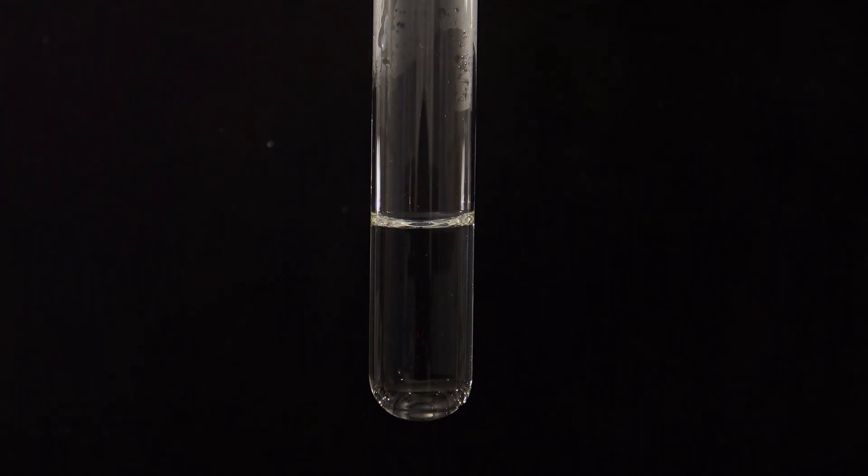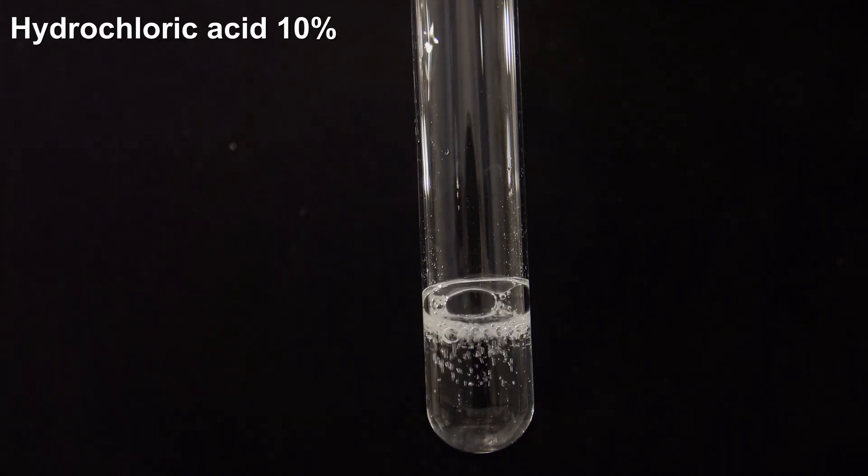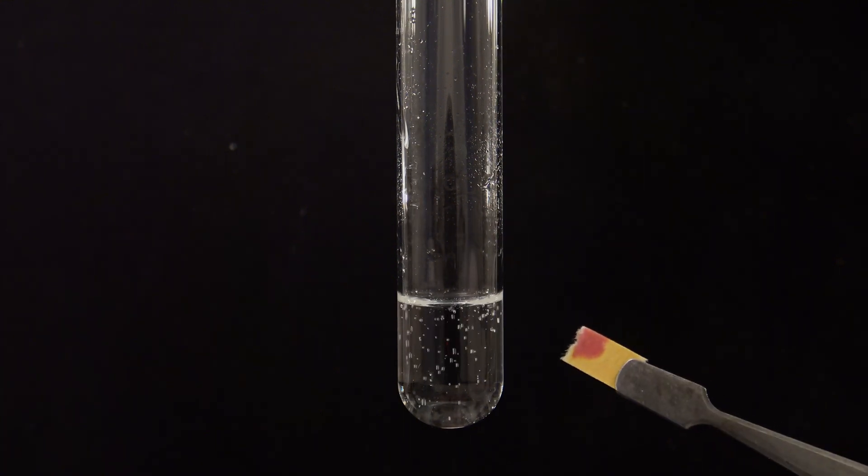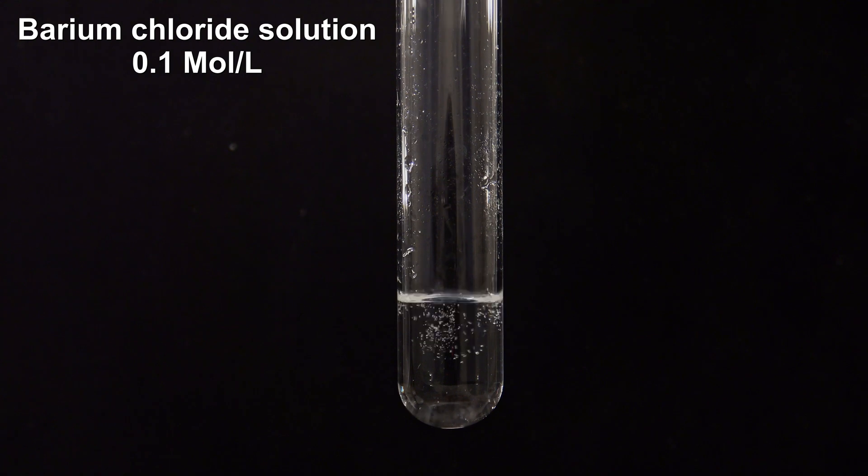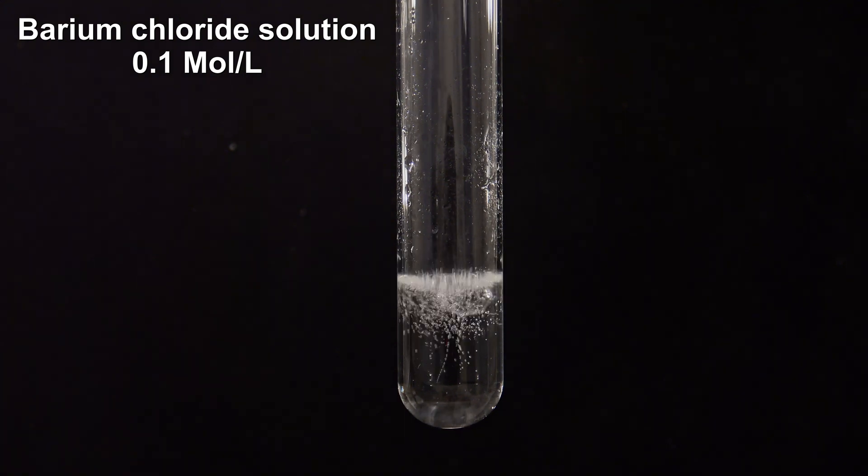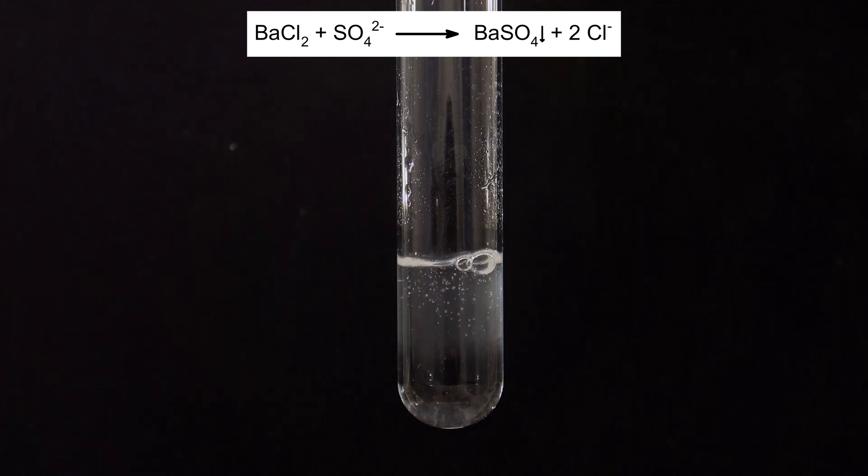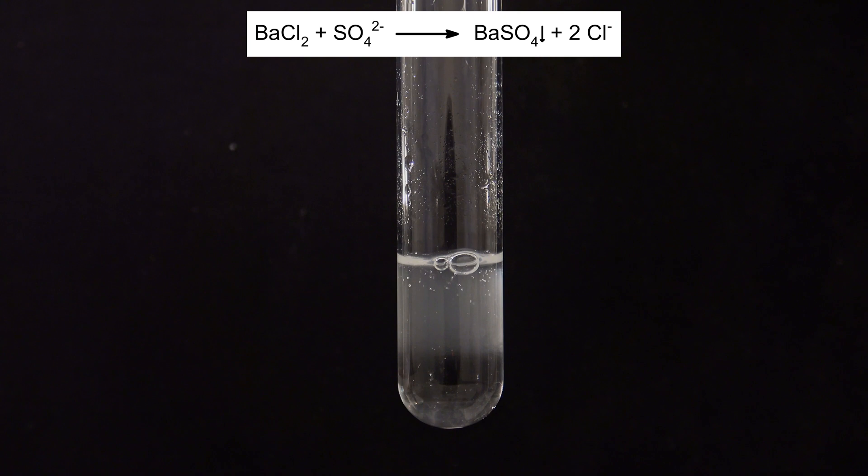Next, a sample of the soda extract was acidified with 10% hydrochloric acid. Then, a 0.1 molar solution of barium chloride was added. The barium chloride reacts with sulfate ions to form insoluble barium sulfate, which is a proof for the presence of sulfate in the sample.